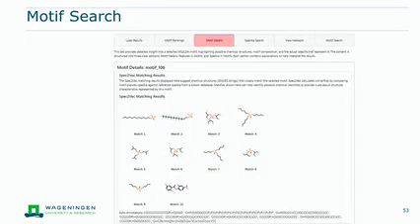Then we can click on a master motif, and we can see the automated annotation also has, I would say, high certainty, it's somehow related to a phosphate group. And we also did some benchmarking, and it seems like it aligns really well with the manual annotation. So if you were relying earlier, when using, for example, MS2LDA, on the manual annotations, this will work quite well for you as well.